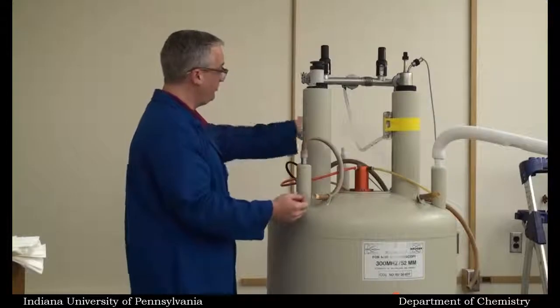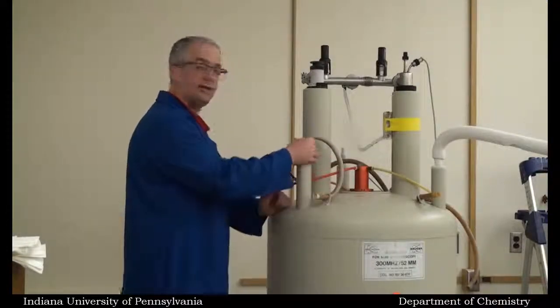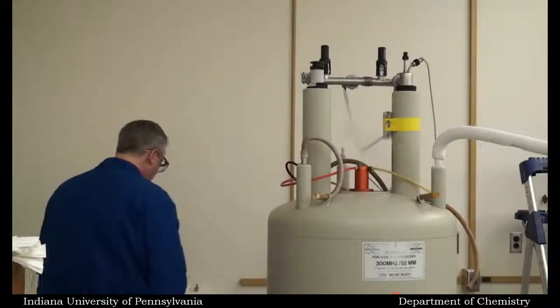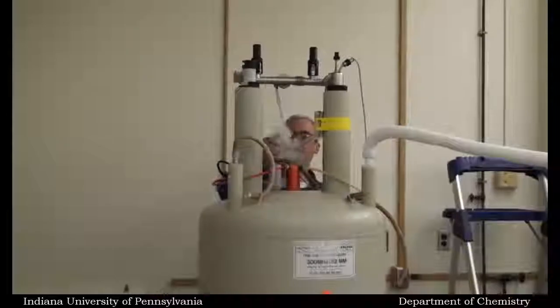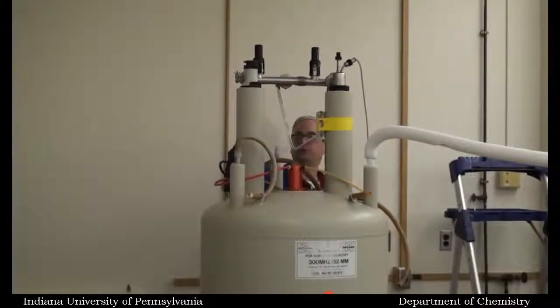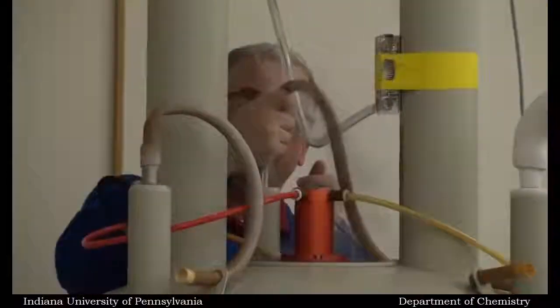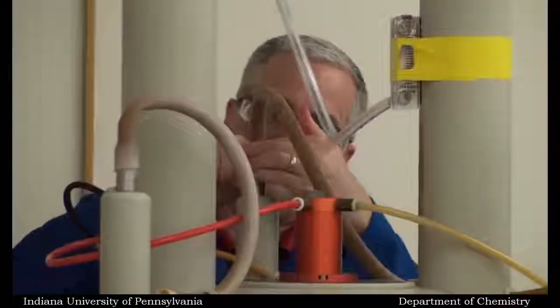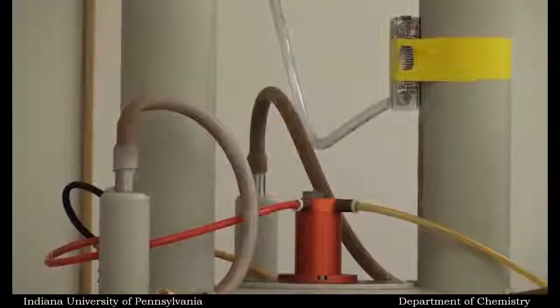And so again, as the pressure builds up after we cap this one, this will open up and release the pressure and again cause the ice to form on the tube. So again, we're going to do the same thing with this one. Getting the water vapor that's frozen so it falls back down. Make sure it's nice and dry. Slip her on, and have it nice and secure.